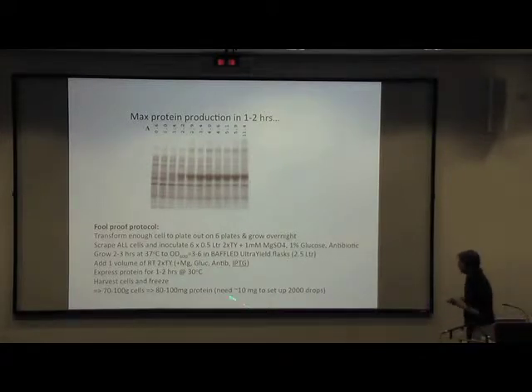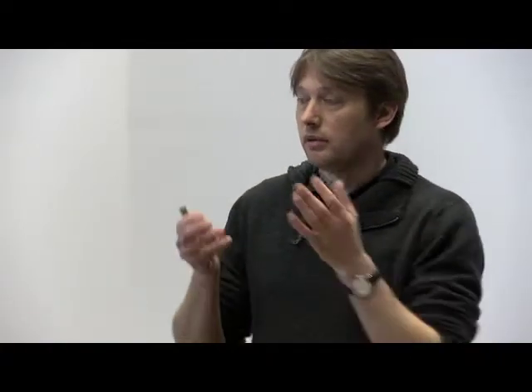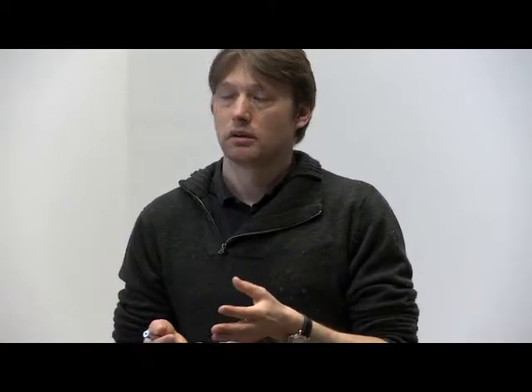So what we then typically get out of 6 liters of medium, we get up to 100 milligrams of protein, and that's enough to set up the 20 plates that we have available. We could go to even more, but currently we're just flooding our columns with protein anyway, so we end up throwing away protein as it is.